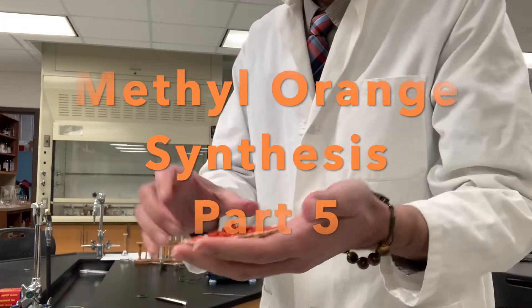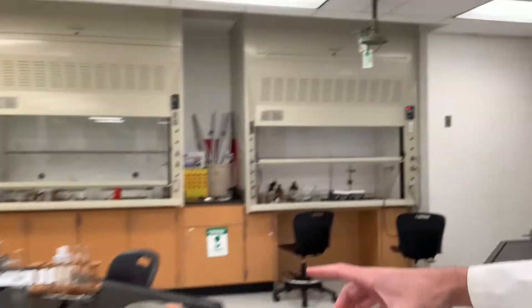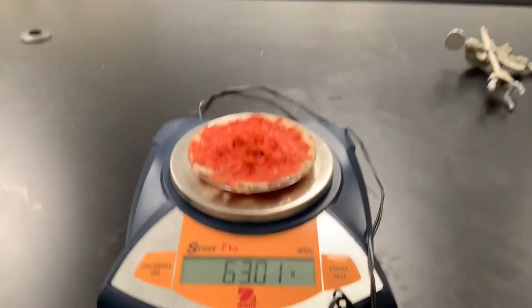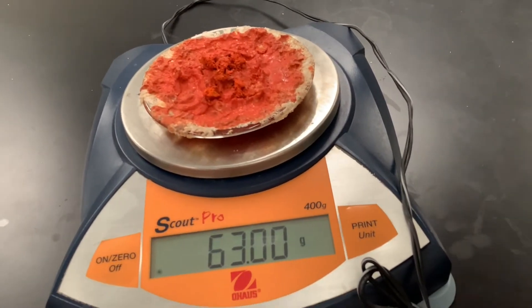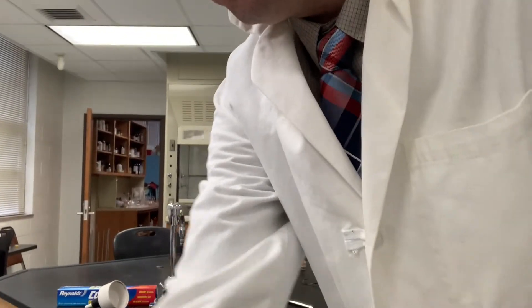We have our methyl orange and the last thing to do is to weigh it. Don't forget to subtract the weight of the watch glass — that's the mass there. Please record all zeros in your data. Let's go ahead and test this to make sure that it works.